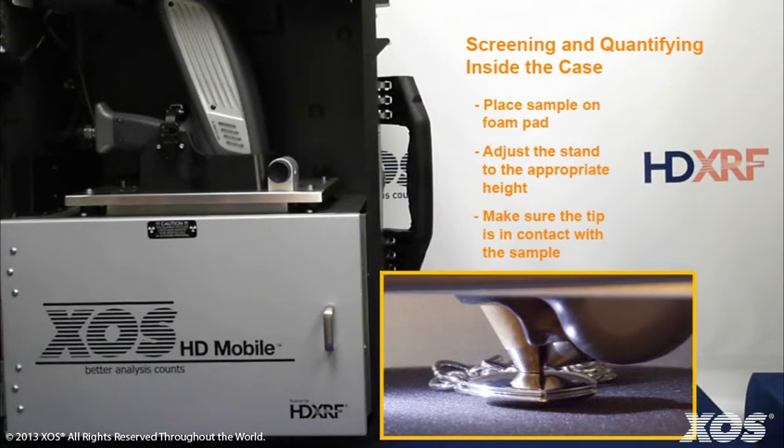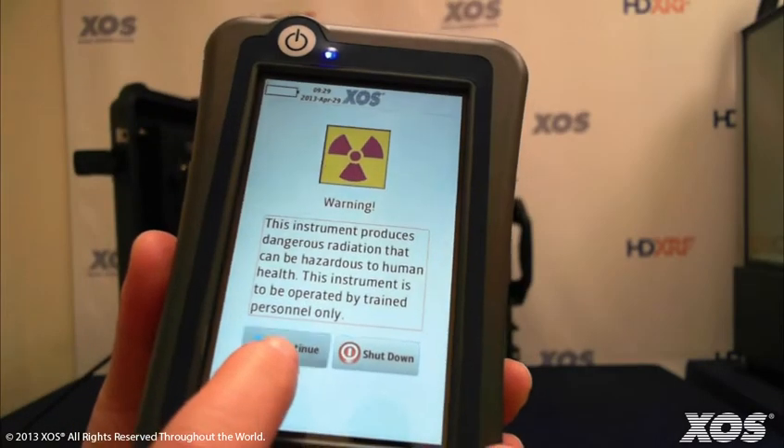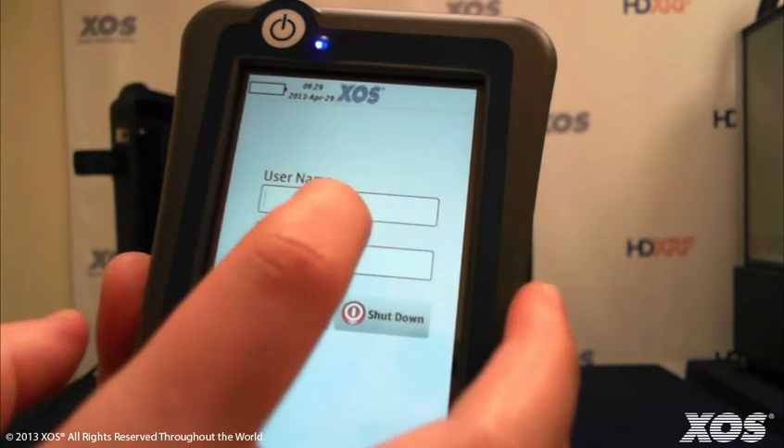For safety and security purposes, only trained, authorized users are able to operate the HD Mobile Analyzer. Sign in with a username and password and then press continue.